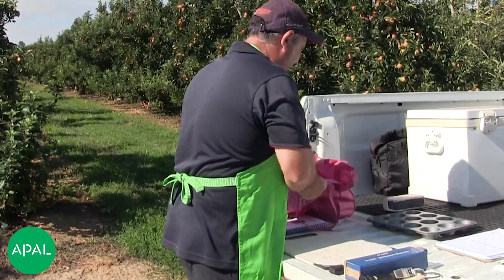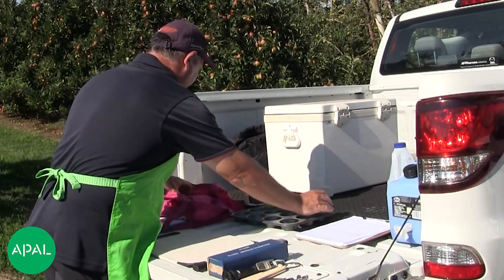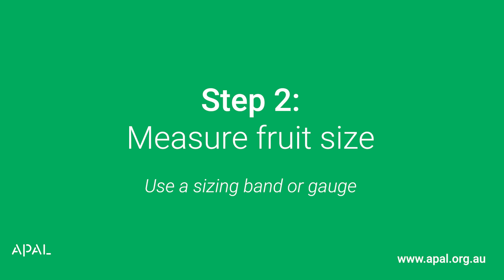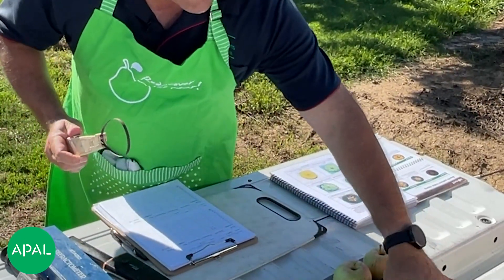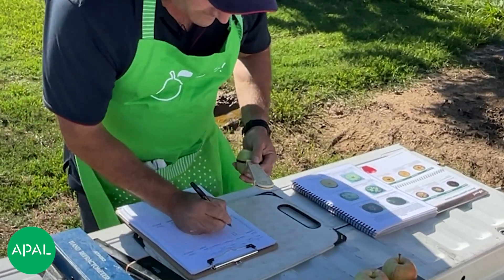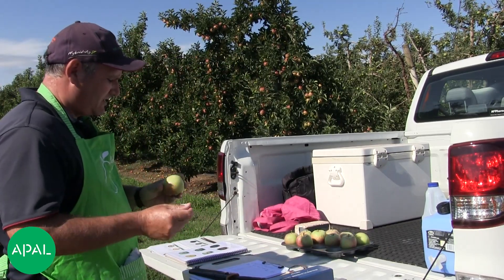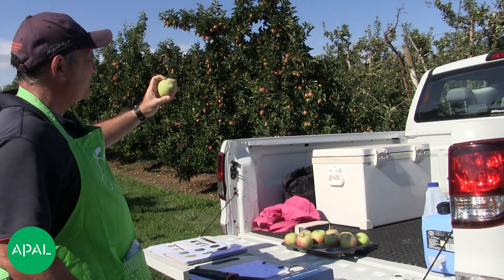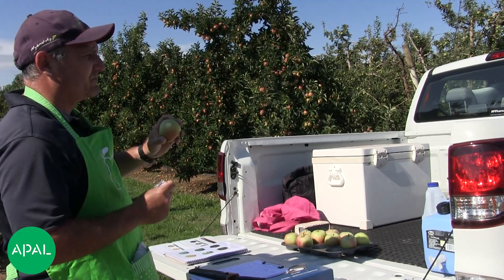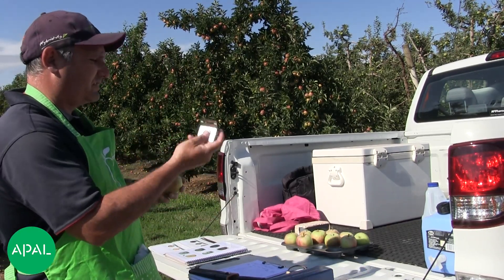The first thing I tend to do is grab more than 10 fruit in the bag. The first measurement I take is the size. Then the next thing is to measure the pressure. Take just one peel on each side at the fattest part of the apple. It's important that you don't take too much off or not enough, because if you take off too much peel it'll actually be softer than what it should be. So it's important to get a consistent peel — one or two passes — and have a good peel.